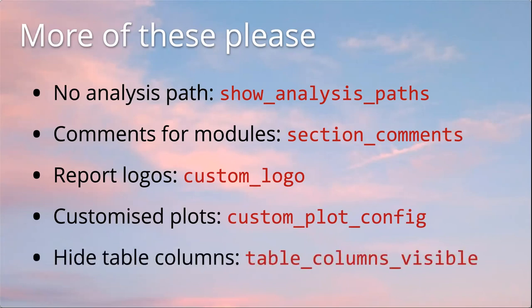On a similar line, you can also customize the tables. Maybe you have percent duplicates reported twice from two different tools, and you only want it once, or something is not useful because of this or that. You can tell MultiQC to ignore or hide certain columns within your tables, which might be good.